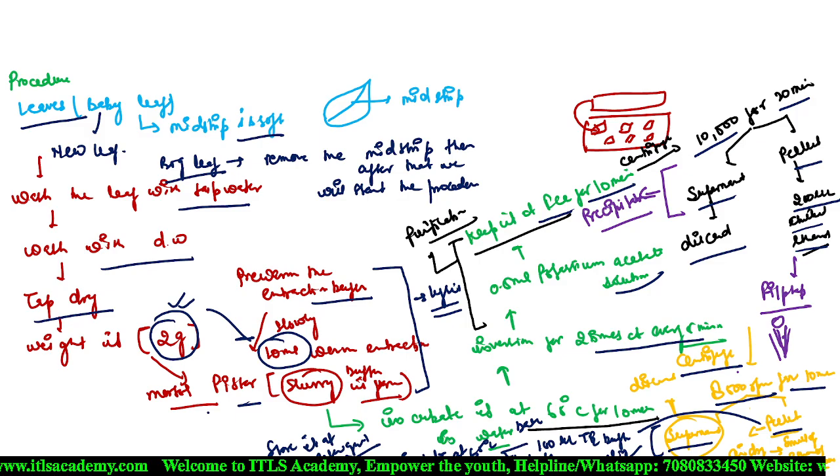So, ma'am, what do we exactly obtain after purification? Like DNA is there, of course, and other cell organelles are also there. During purification, other elements which cannot be tolerated at that higher temperature will be removed from the pellet, and when you do the centrifuge, they completely separate out. That's why we do a purification.